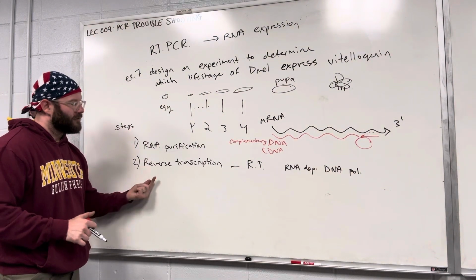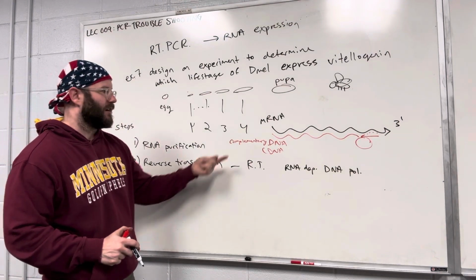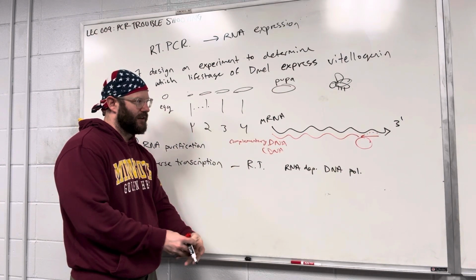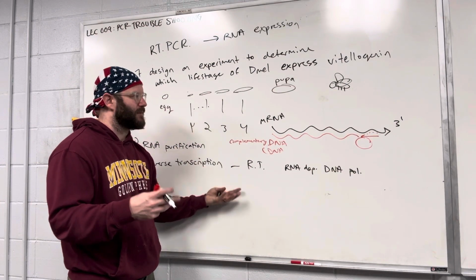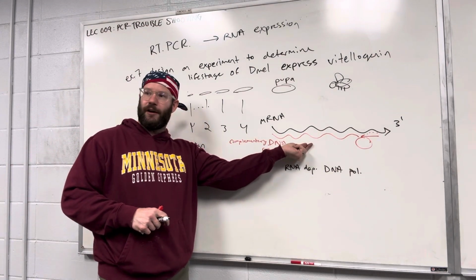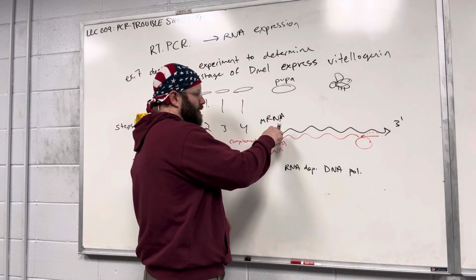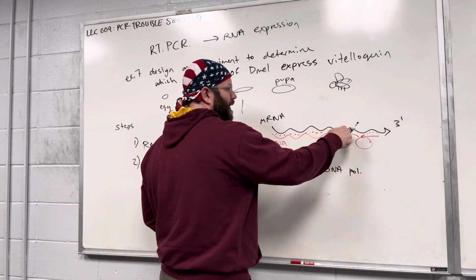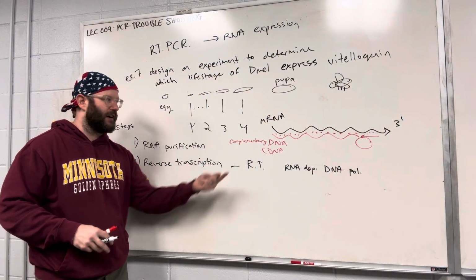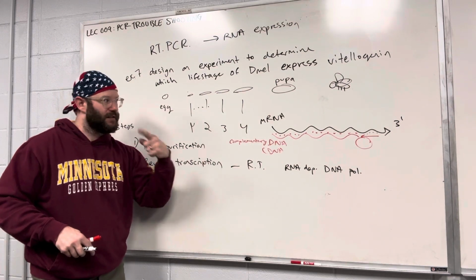Okay. So why do you do this? The reason that you do reverse transcription is because RNA is not very stable. It's actually very difficult to study because there's a whole bunch of enzymes that degrade it, and it just kind of collapses pretty quickly. So if you can build this, you've essentially stabilized the transcript. So if you have cDNA, it's now in a more stable construct where you can do various things to it. Sometimes people will sequence from this, which is called RNA-seq.